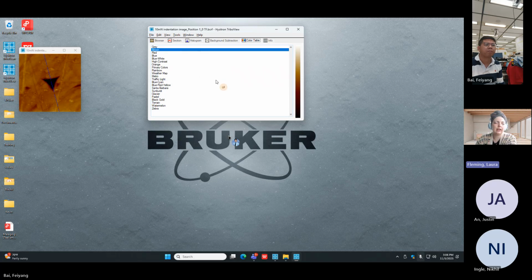Are you asking if the AFM files will open in TriboView? Yes. I don't know. I can't guarantee that. I can only guarantee that images taken by my instrument will open in TriboView. Yeah, we'll use Gwydion. Yeah.